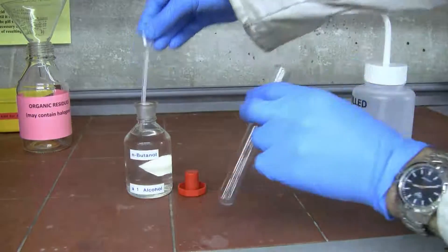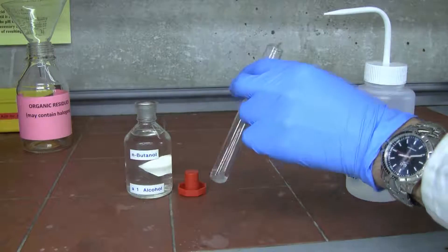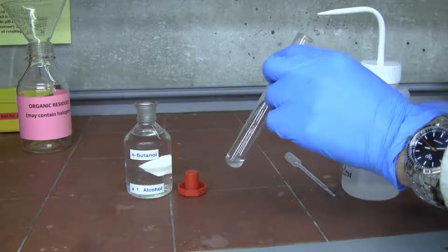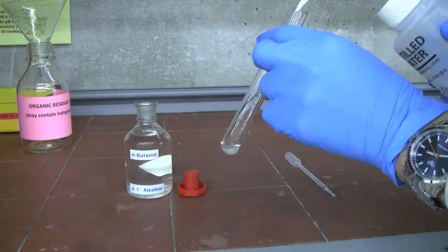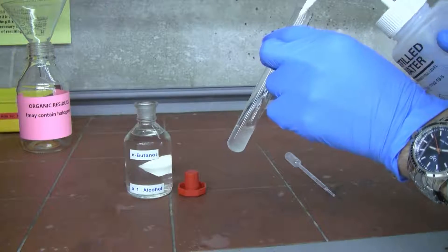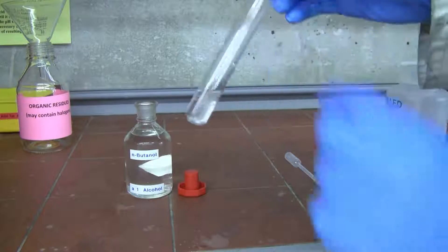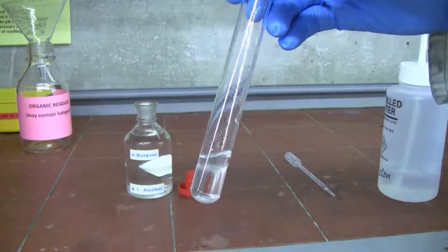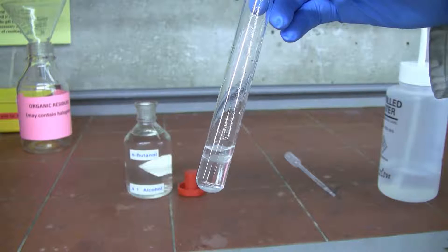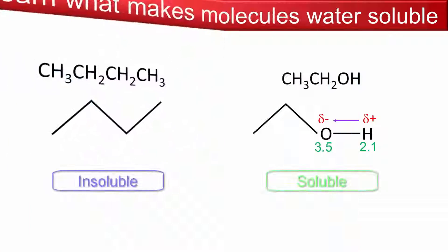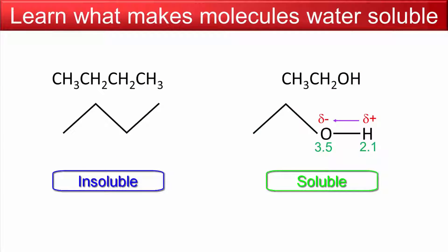If you try that test—if you try and mix a polar liquid with a non-polar liquid, chosen butanol in this case—you can see that they don't mix. This is shown in the appearance of two layers that form in our mixture. You can see the water layer on the bottom and the non-polar layer on the top. Very easy to do the experiment. I want you to focus on understanding why you see what you see.